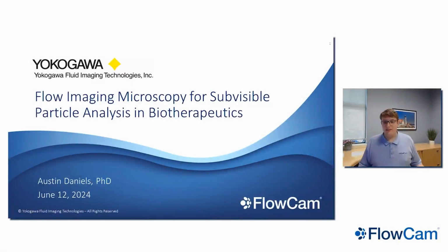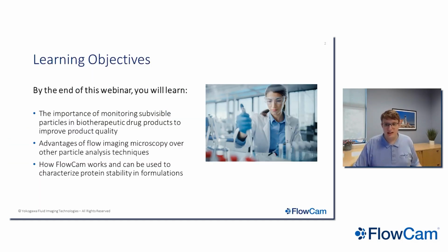All right, so thank you for that introduction. Today's webinar will provide an overview of flow imaging microscopy, a commonly used particle analysis technique for subvisible particles in biotherapeutic samples. This webinar is meant to provide you with an overview of why particle monitoring is so important in developing safe and effective biotherapeutic drug products, and the role these particles can play in product safety and product quality.